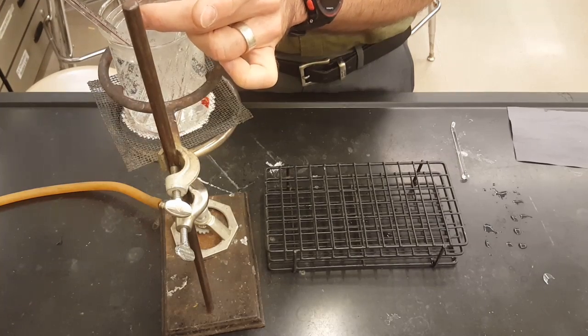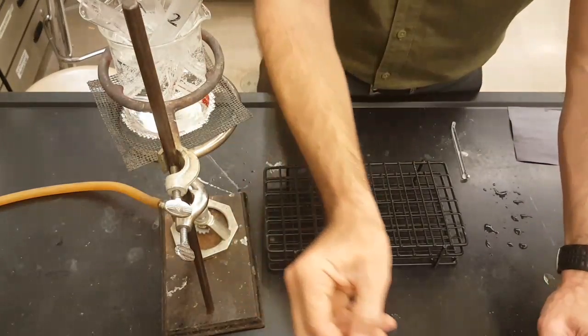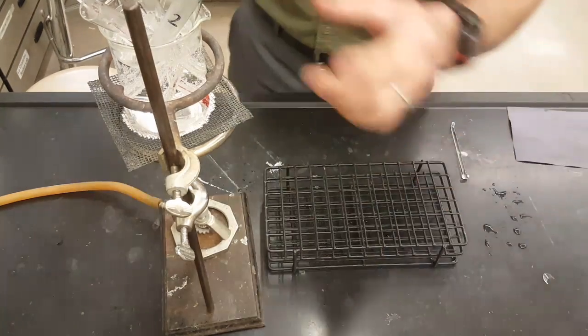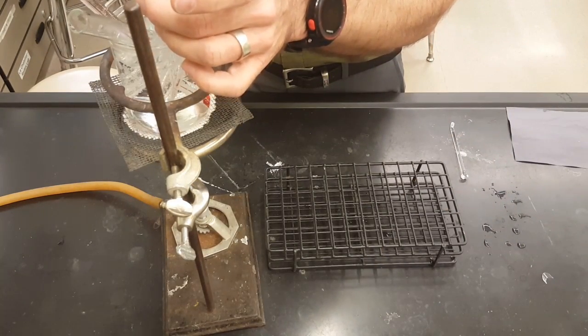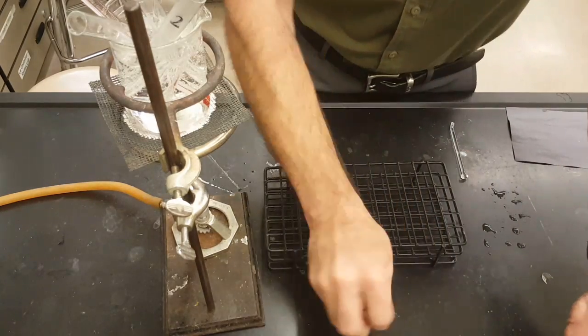So it's okay to stir, and then before you put your stir bar in the next one, make sure that you rinse it in your sink. Put it in the next one, stir. Okay, it's all nicely dissolved. And rinse.